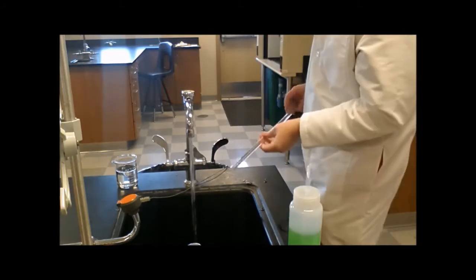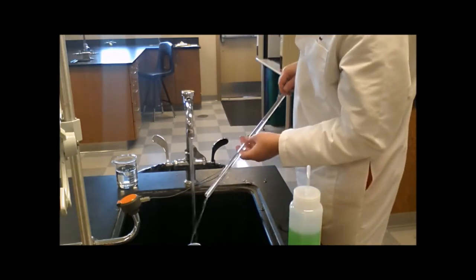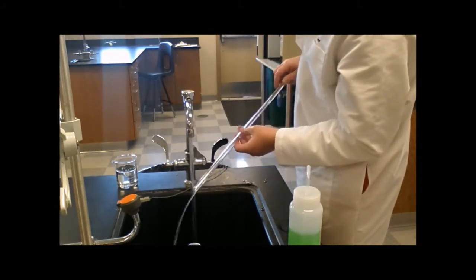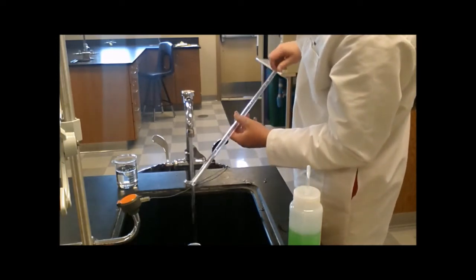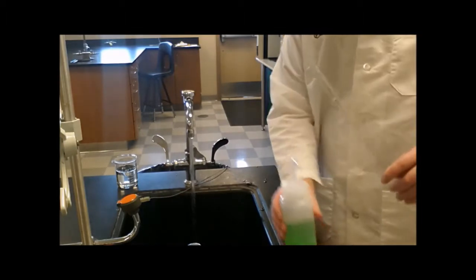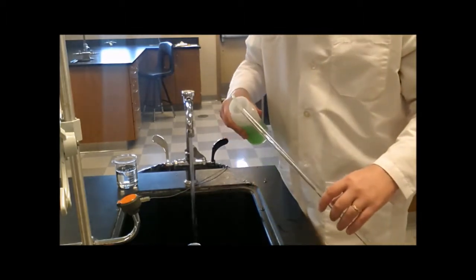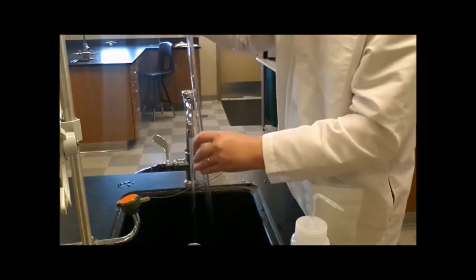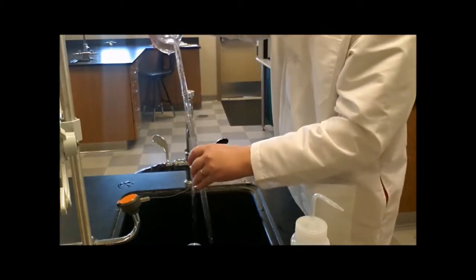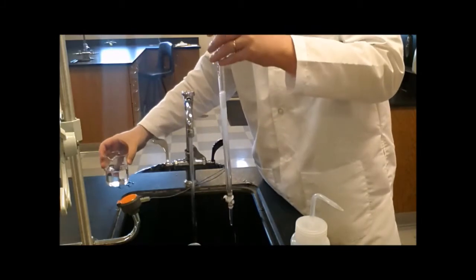I'm going to rinse the Buret out. And then instead of letting it all slowly dribble out the stopcock, I can turn the Buret over and let it drain out the top. I want to use just a little bit of soap. A little bit of soap goes a long way. And then I can fill my Buret up with water again. I don't have to fill it all the way up.